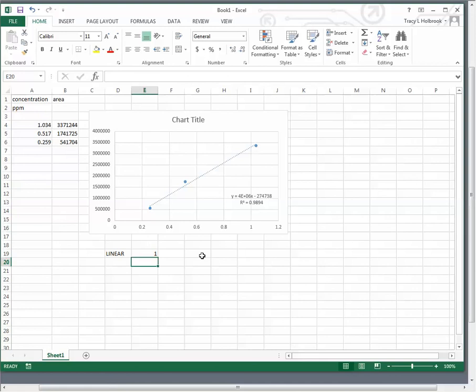If you have a calibration curve that gives you a 1 as a readout, then you can't ask for any better. You need to ask for a pay raise or extra credit. The further I am away from 1, the worse my calibration curve is.